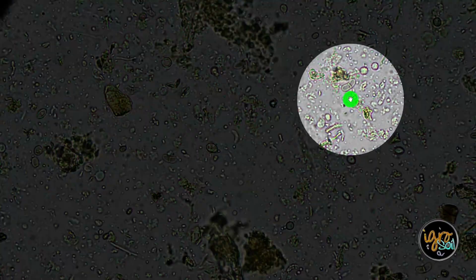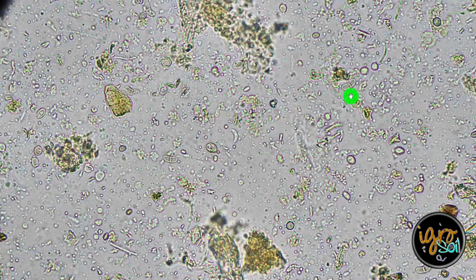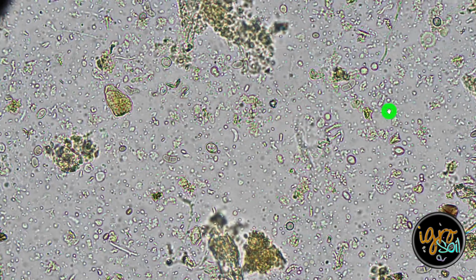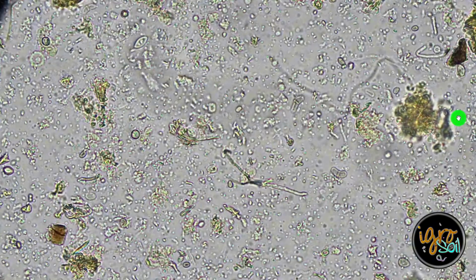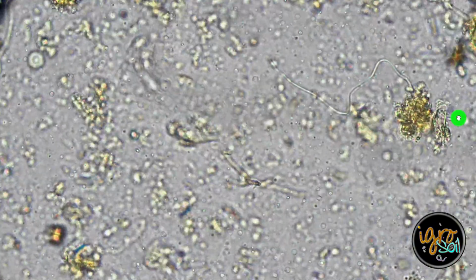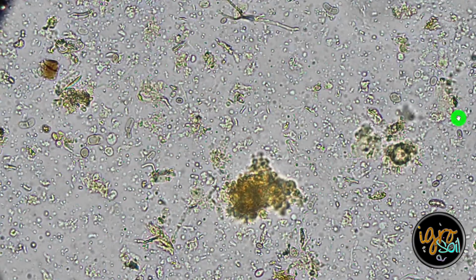I'm seeing a lot of this here. Kind of looks like a jelly bean with a line going through it. So I'm gonna guess that that's a spore. So I'll start paying a lot more attention now. I'm gonna start doing some more work with these mushroom blocks, and Rick over at Gardens and Glass. We've got a little project going.